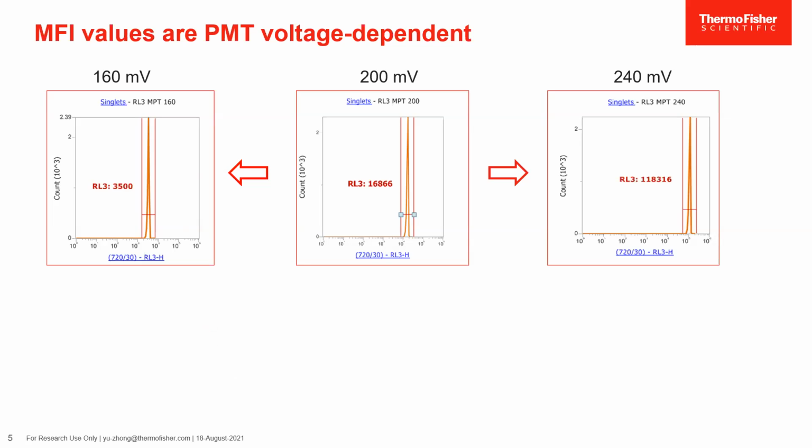So this complexity of the instrument design and the signal amplification system has resulted in many types of inter- and intra-laboratory variations. That all depends on the PMT setting: the measurement of the so-called mean fluorescent intensity of a given sample on day 1 could be different from day 2, or also different from different labs.